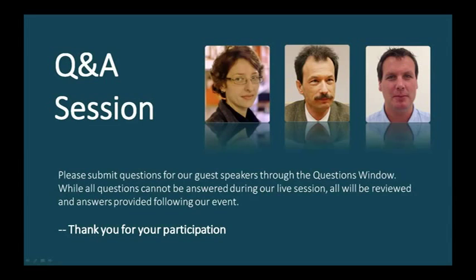In some labs they do just fine, in others they don't learn at all. Our experience up to now is that in IntelliCage they make very few problems. So apparently the elimination of anxiety and of human contact helps a lot to get more reliable performance from this strain. We tested several mutants on a 129 background, went through the whole test battery and got useful results.